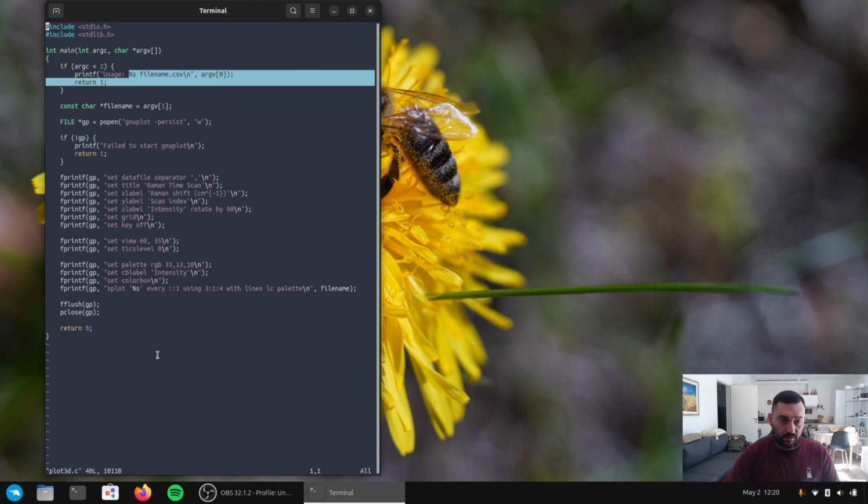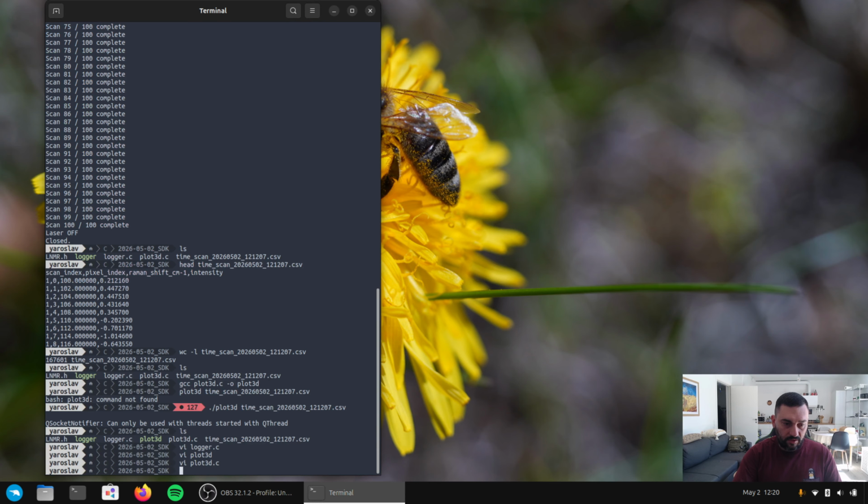I think this demo was pretty straightforward, and thank you for your attention. With this video we covered another part of our SDK, which was the C SDK under Linux. In previous videos it was Python for both Windows and Linux. And the upcoming video will be C in Windows.